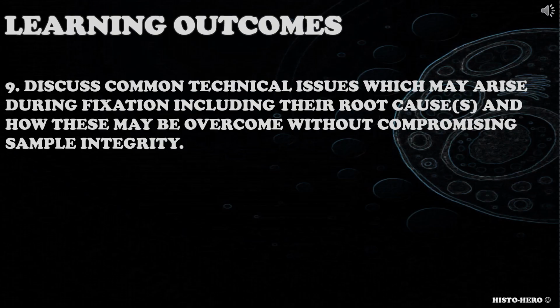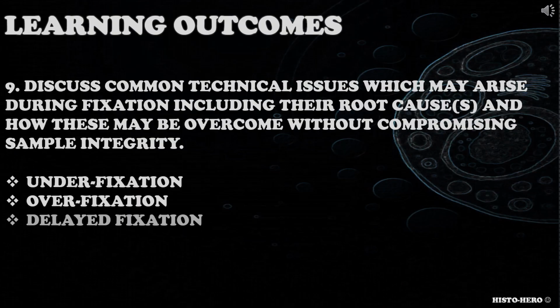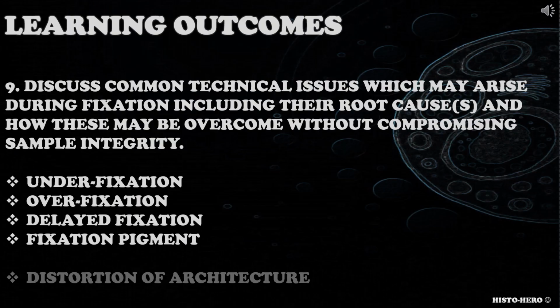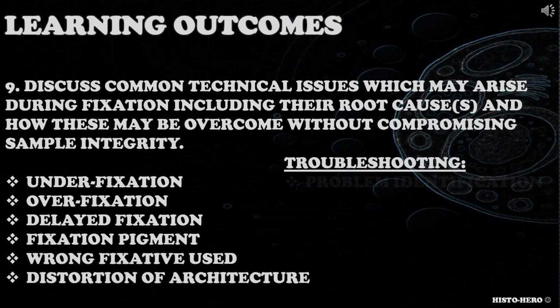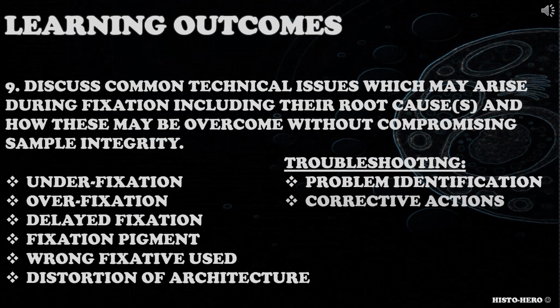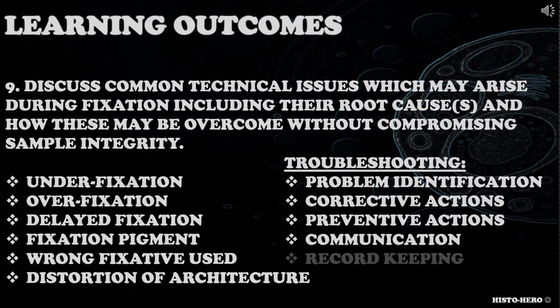Candidate could consider under and over fixation, delayed fixation, fixation pigments, or distortion of architecture, use of wrong fixative. Steps during troubleshooting like problem identification, corrective and preventive actions, communication, record keeping, and so on.